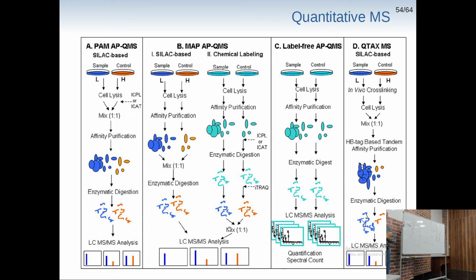What can we actually try to do to be able to compare two different proteins using mass spectrometry? Labels. We can have either isotopic labels, right? Those proteins which have, let's say, heavy carbons or heavy nitrogens will behave almost the same in our sample. Or we can label them after we already extracted the proteins from our sample, right? And also label them with some stable isotope.